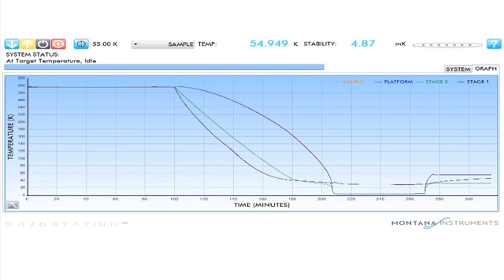You can set the temperature to a higher set point without having to press warm up or cool down. Simply set the target temperature to a new value and the system will rise to that temperature and stabilize.